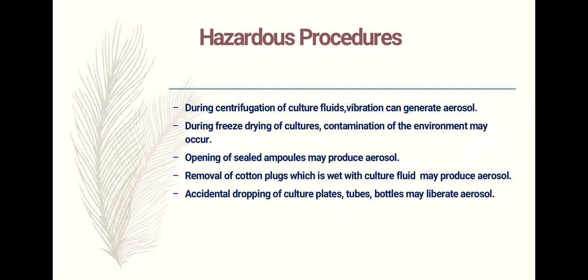This is a very wrong practice. We should not allow the cotton plug to get wet during sterilization. Otherwise they will surely produce aerosol while the cotton plug is opened. Next, accidental dropping of culture plates and tubes. This is another thing that may happen by mistake or unknowingly. If we spill the culture, naturally this may lead to severe, direct spread into the environment.